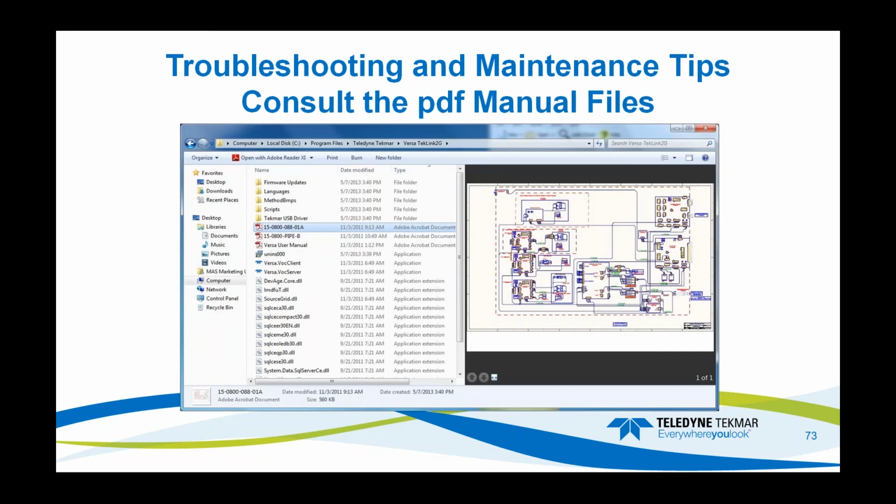First of all, for the Versa, as within all of our documents, underneath the Versa directory that was loaded during install, there are 3 PDF files. As you can see with this first one here, a very intricate diagram of the electronics. When you blow this up, you'll see that a lot of these numbers are the part numbers for the part, for the board, for the connector. The other file is for the flow diagram.